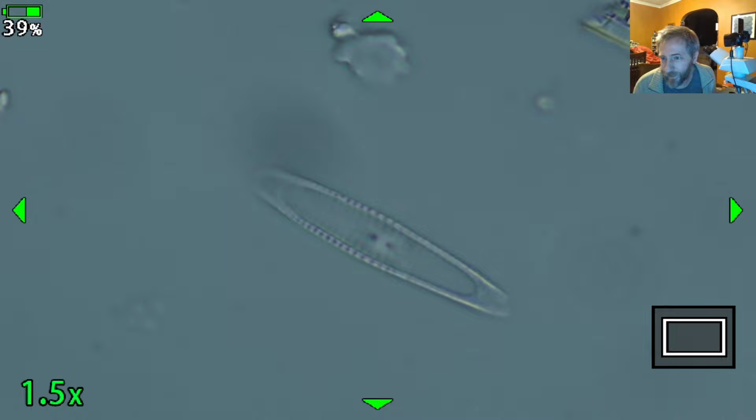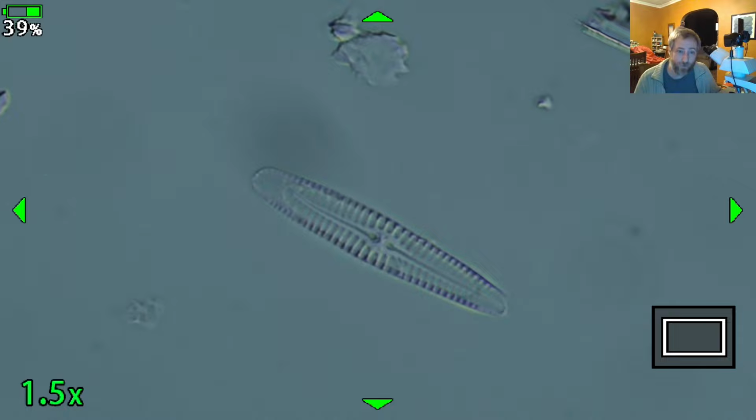Can you see changes in water properties in the different clones, like tree rings or ice cores? I can see changes in the diatom assemblage associated with changes in environmental conditions. That's how I actually use them to reconstruct past climate or water level or drought or nutrient changes. So if I were taking a core next to a place where people lived, I could see when people inhabited that site. For example, there would be a change in the water quality associated with farming in the landscape, adding nutrients to a pond or something. So I can use that to reconstruct when people moved into an area, when they moved out of an area. If it's a really old record of people coming and going, I could use it to reconstruct when major droughts were. I could use it to reconstruct changes in salinity.